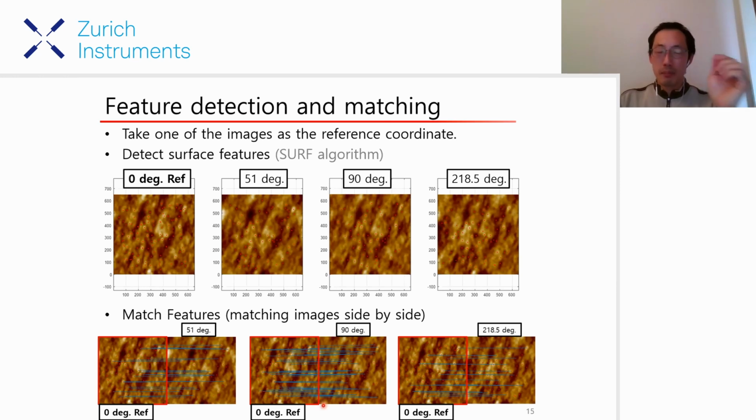If I make a table for the coordinate conversion from one image to the other, then that will give you the transform function from one image to the other. But by using a computer vision algorithm, the workload is lower and it works faster.